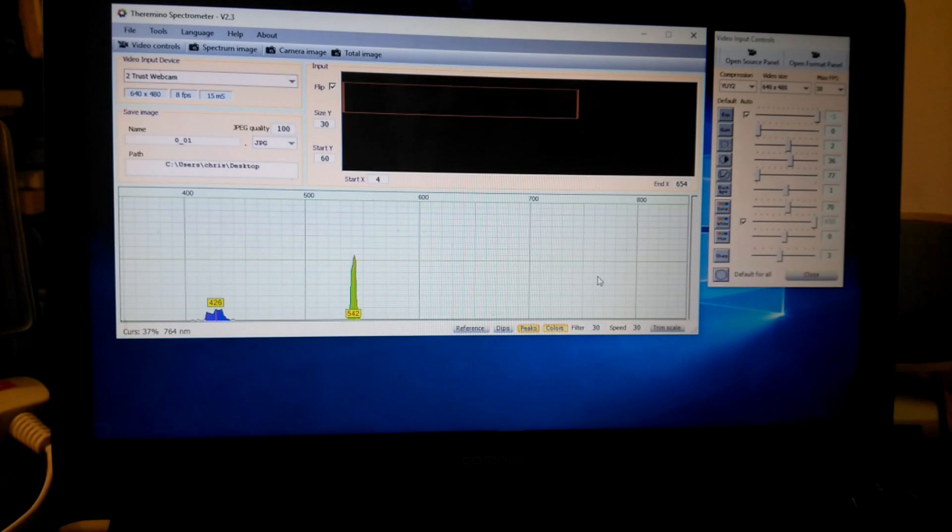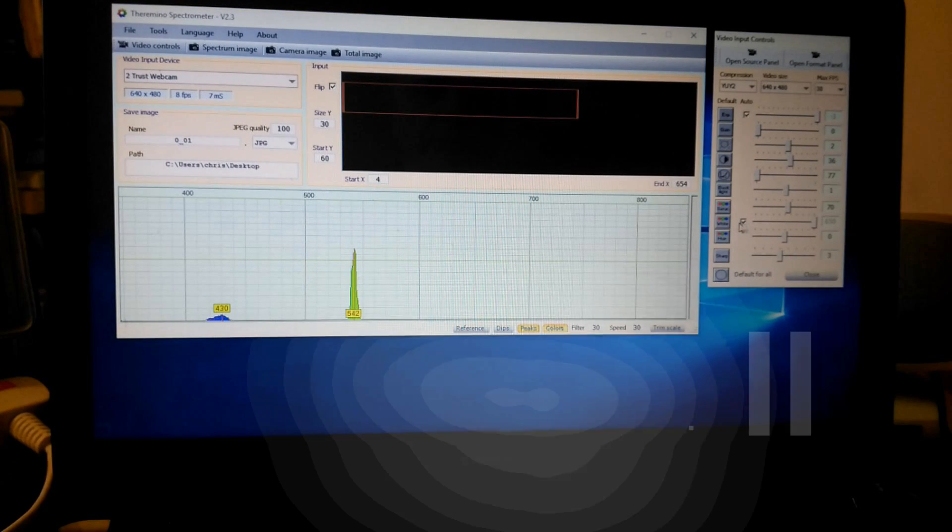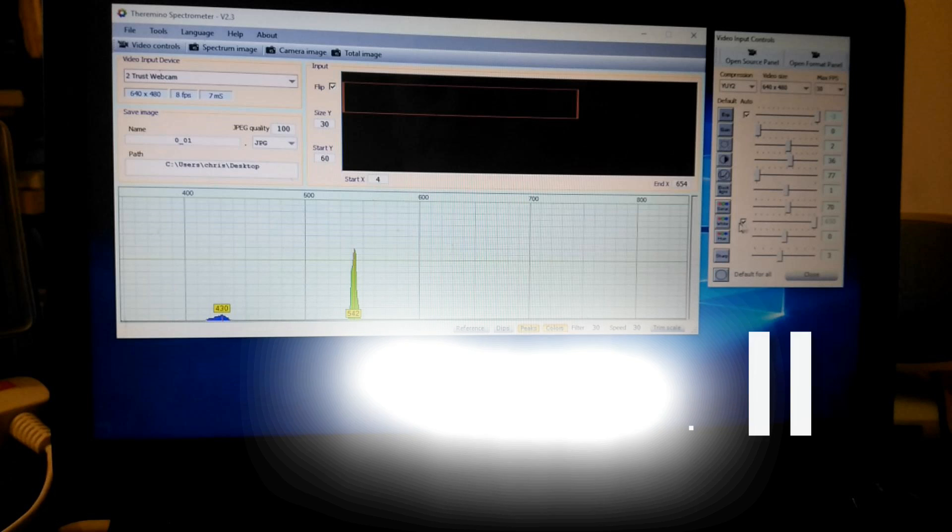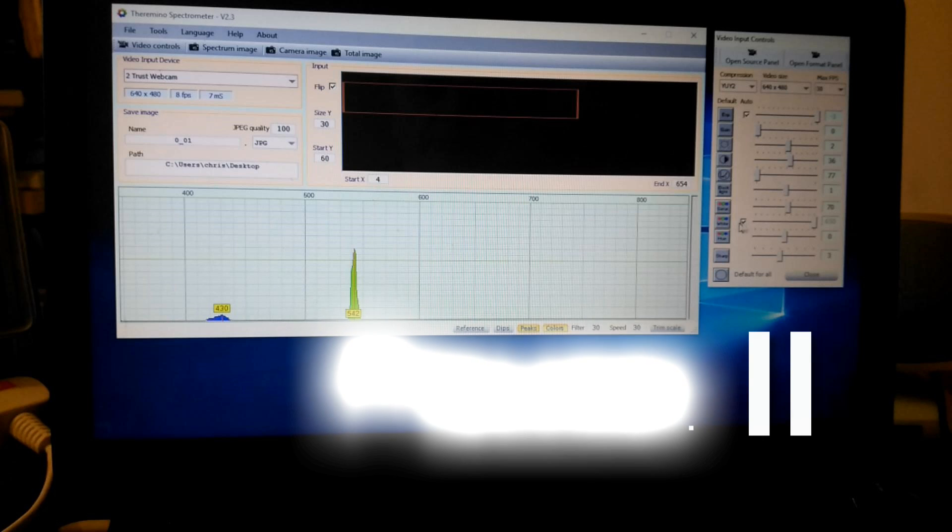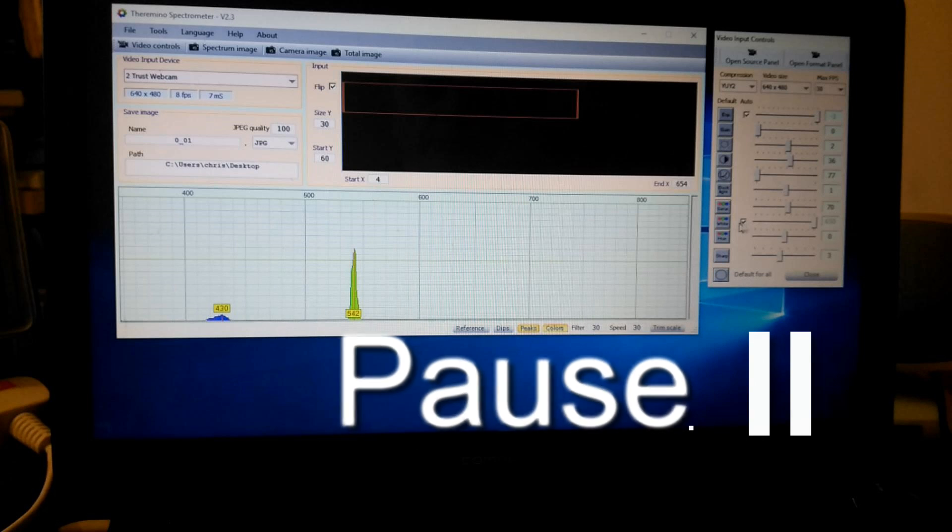So let me turn the automatic gain off. Actually, that's not correct. It's blue, because it's blue light. If it were UV, it would be black. So the spectrometer is saying that this lamp is not really emitting any significant UV radiation.